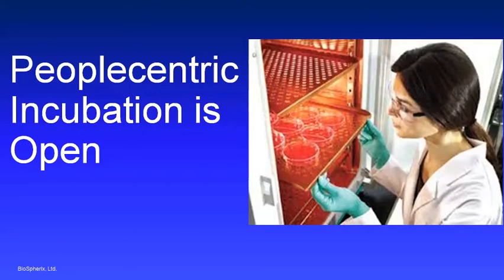It's got that big pan of water in the bottom, which is always contaminated. Every time you open the door, all the gas levels change. So the CO2 drops, the oxygen goes up, and the oxygen levels inside that room air incubator are lower than room air, but they're not as low as they need to be for cells that come from inside the body. So it's a hyperoxic environment for cells. And it's a highly variable environment for cells, because whether it's you accessing your cells or someone else accessing their cells, it's always changing.